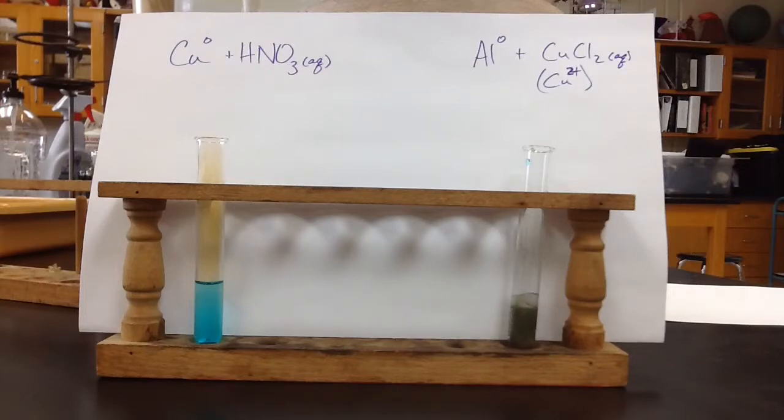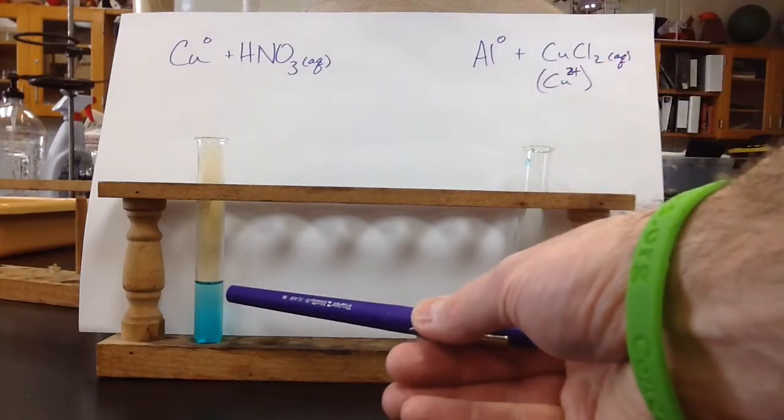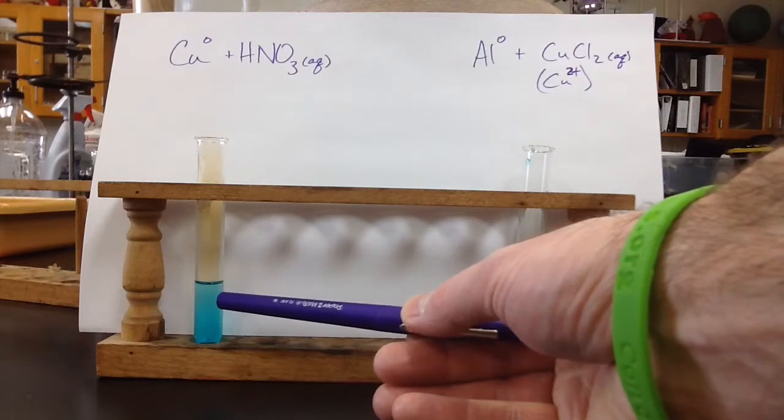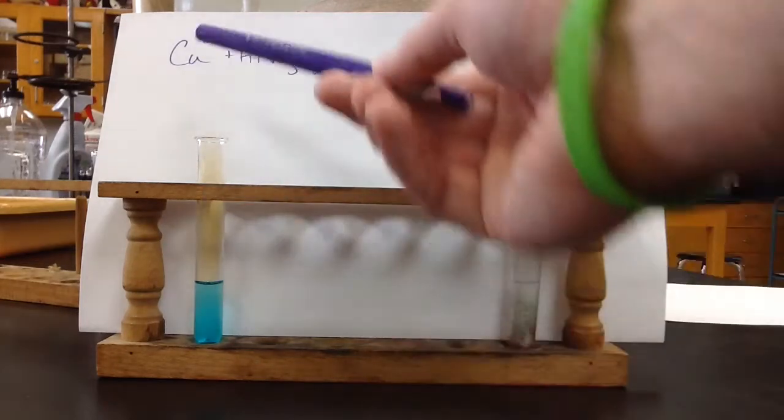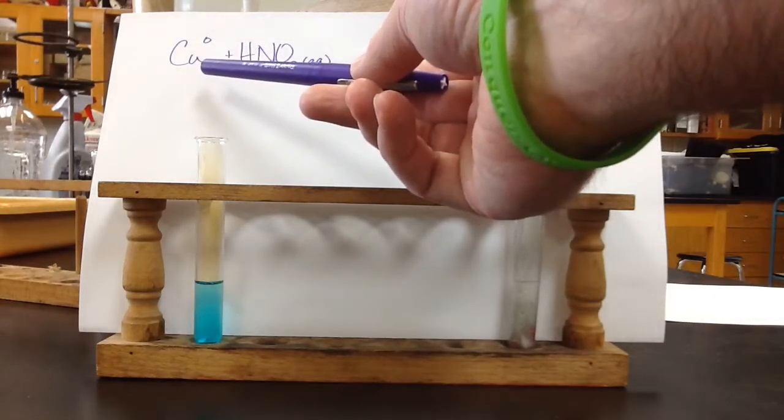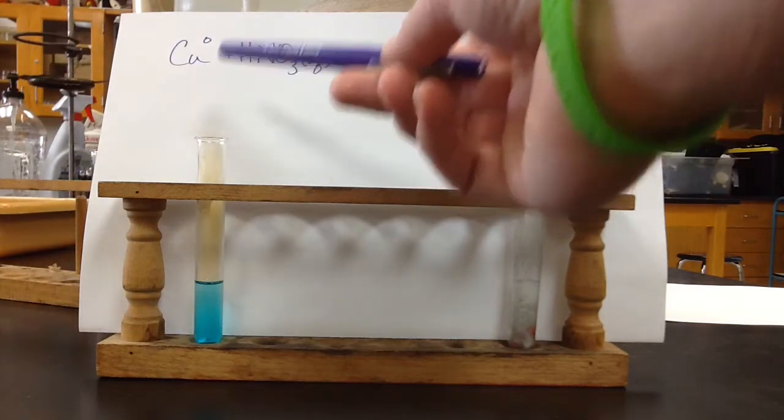And on the left-hand side, it looks like our copper has reacted completely with the nitric acid. And so the nitric acid started out clear, and then when it reacted with the copper, now it turned kind of a blue-green color. And that's what we see right over here. So this solution is now green because the copper metal that we started with is now turned into copper ions.